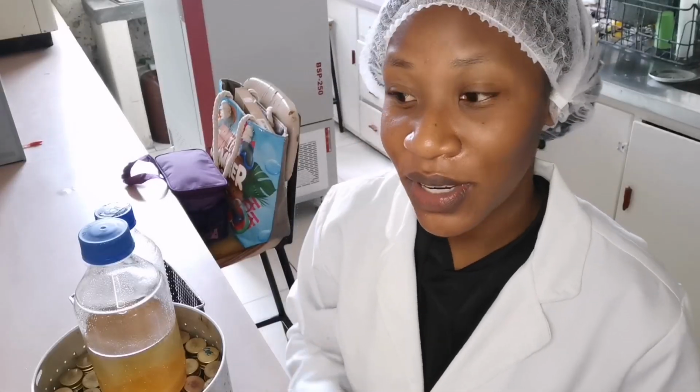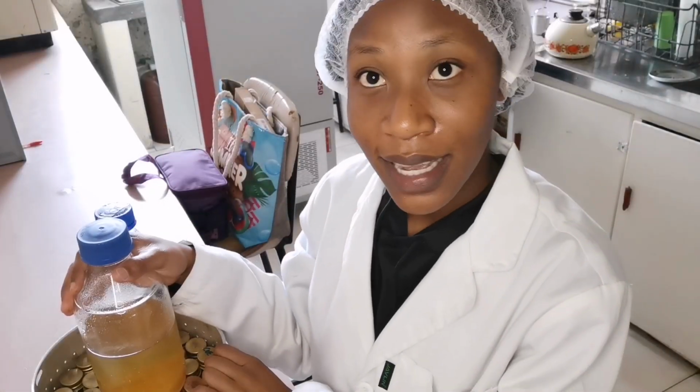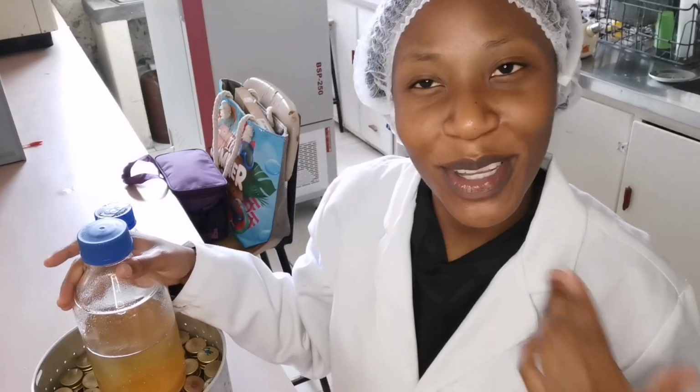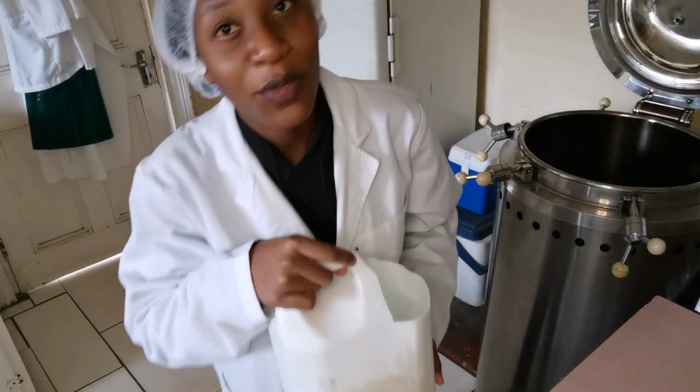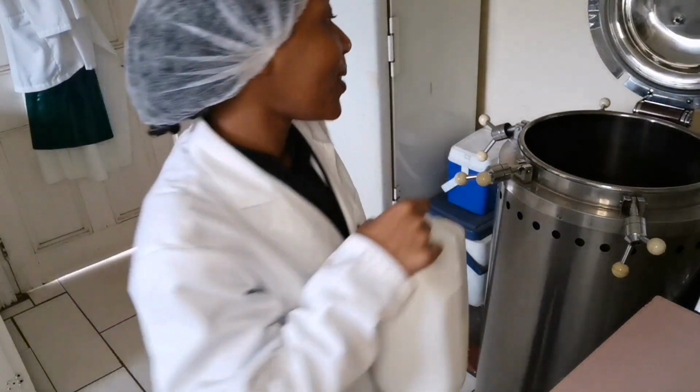Now we have to sterilize the plate count agar and the Ringer solution in the autoclave. Do it with me. Okay, so now I'm filling the autoclave with some water.